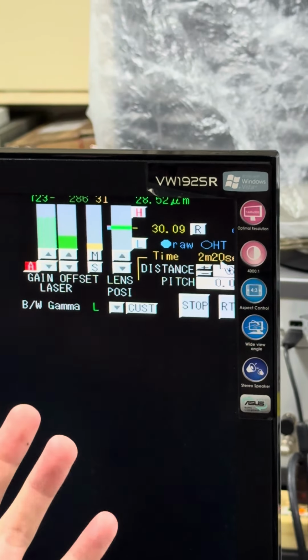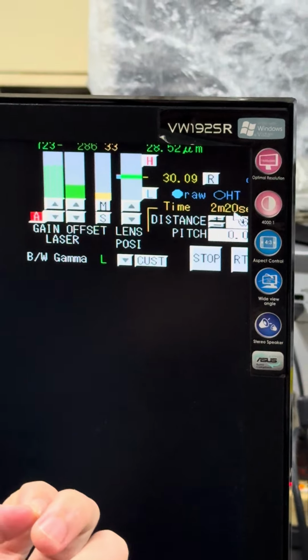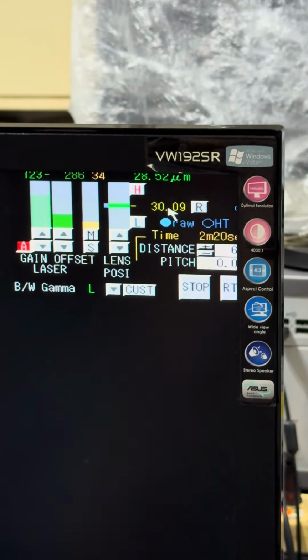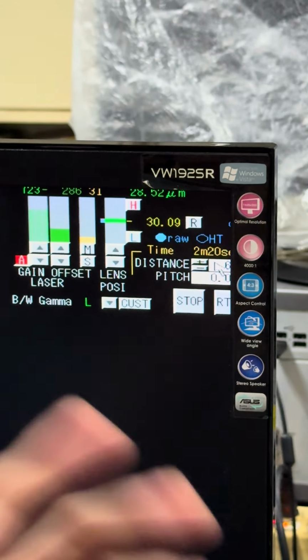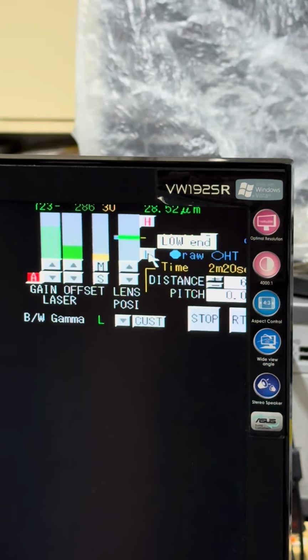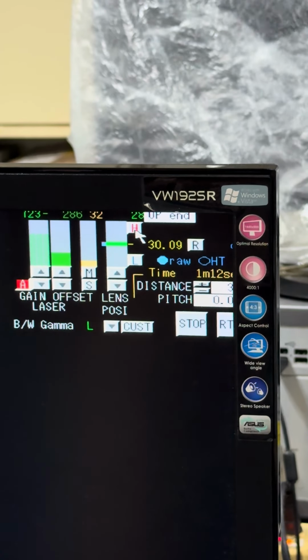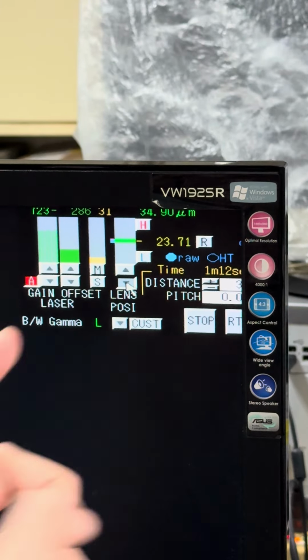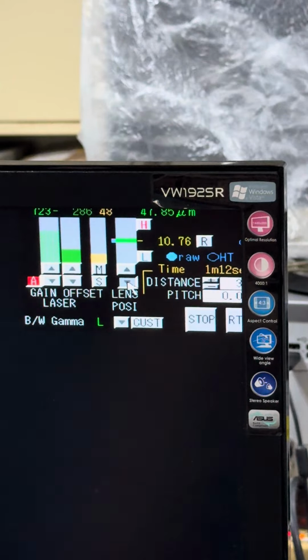Although it will also depend on the pitch value I mentioned before, it would be time consuming, so you don't want to take that high a distance. But in this tutorial I will demonstrate how to follow the traditional manual. So we have the target value right here, we set to high. Now we control the low by holding the down button until we reach our desired value.